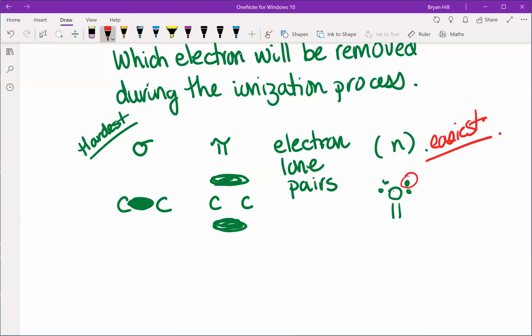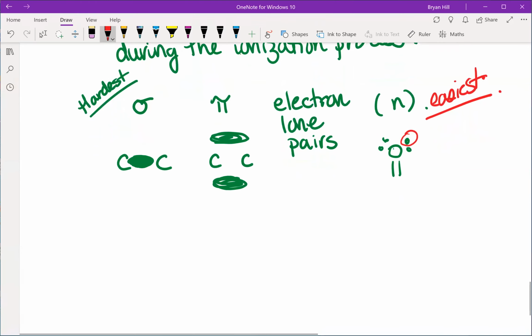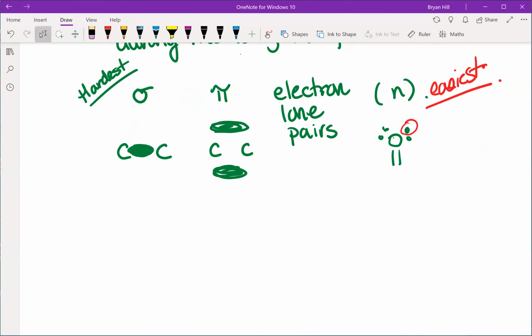So I think in the last class, we basically had a chart of which type of functional groups survived. Like if you were to ionize a molecule which had functional group A, B, C, or D, which ones actually survived to make it to the detector before they fragmented. You'll notice that a lot of the functional groups that had heteroatoms were ones which didn't last a long time. So it's these lone pair electrons that tend to be ionized first.